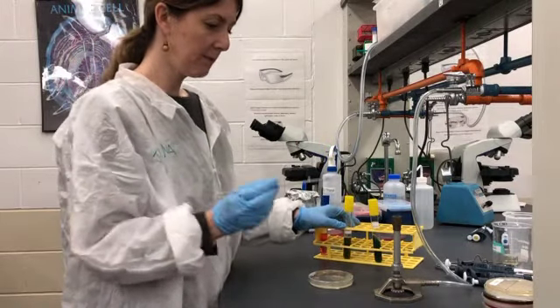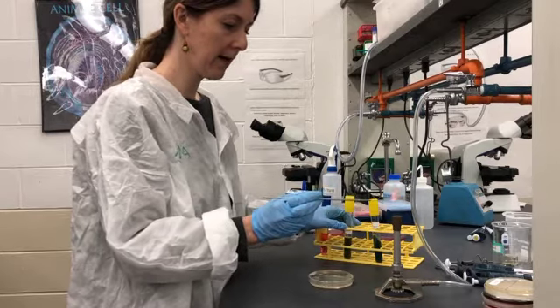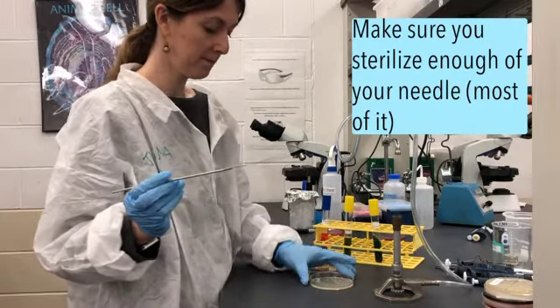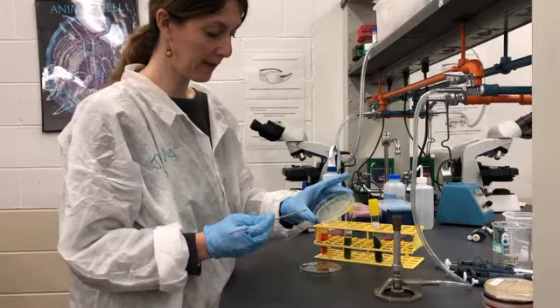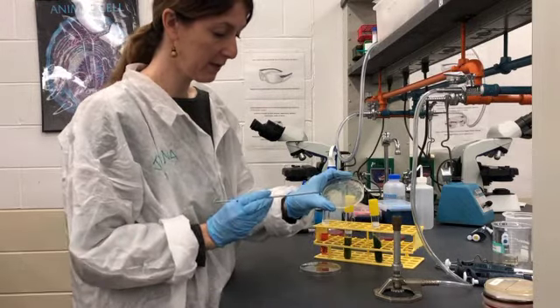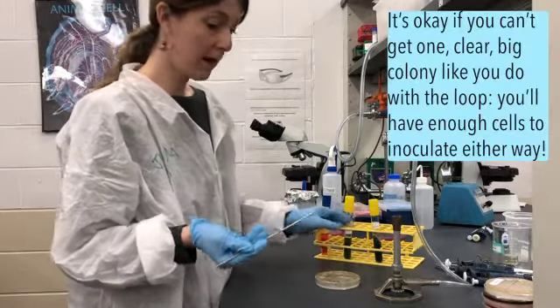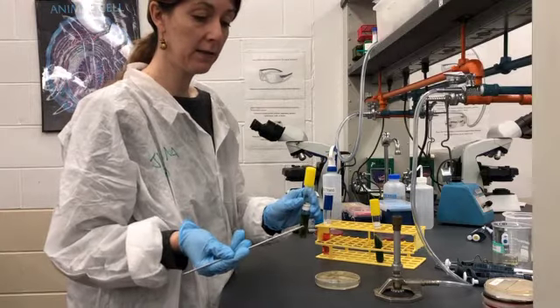So to inoculate this media, we're going to, again, heat sterilize our needle, maybe about 3/4 of it. We're going to cool it, maybe the first ½ centimeter or so on the media in an area where there is not a colony. And you're going to do your best. It's harder than with a loop. You're going to do your best to kind of collect a little bit of a colony or all of a colony if you can get it of the bacterium on the tip of that needle.